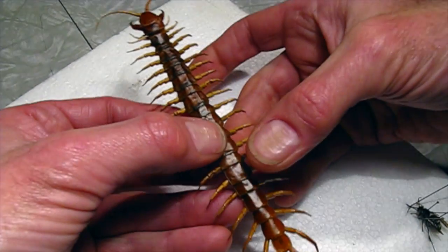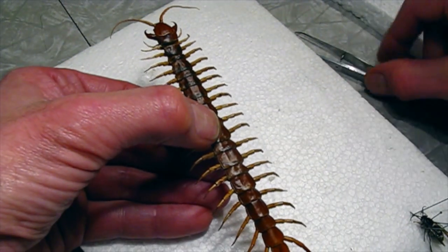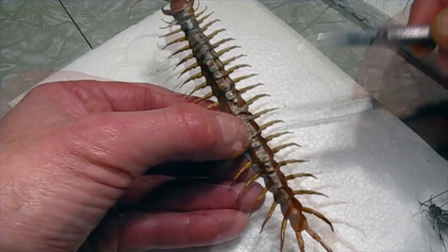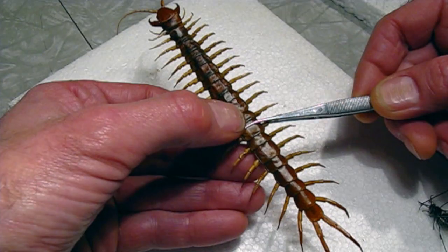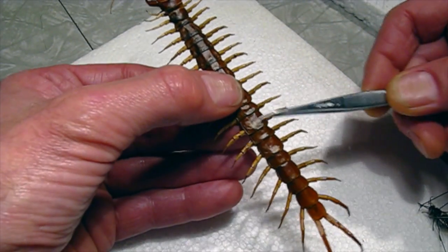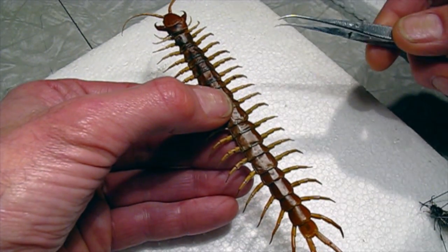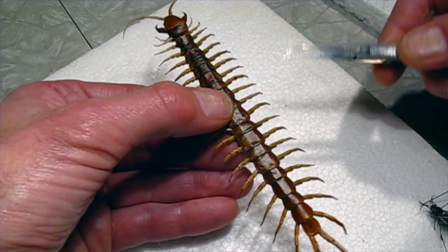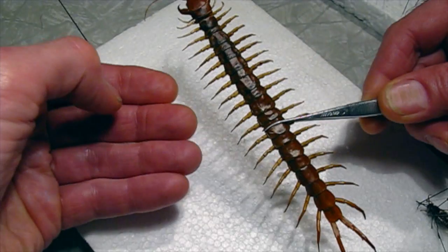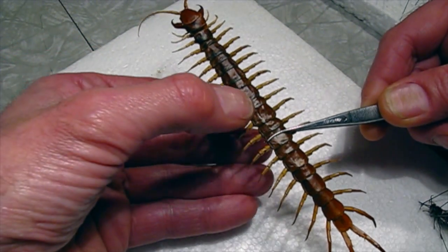Now, normally this would be the point we'd put a data label on this. It was a captive specimen. I don't really know what species it is. I suspect it was Scolopendra subspinipes, but I'm not really sure. I think they call that the redhead Vietnamese. I'm pretty sure it's an Asian one just because that's where they come into the pet trade for specimens. But since I don't really have that data, I'm just going to hold off putting a label on it.